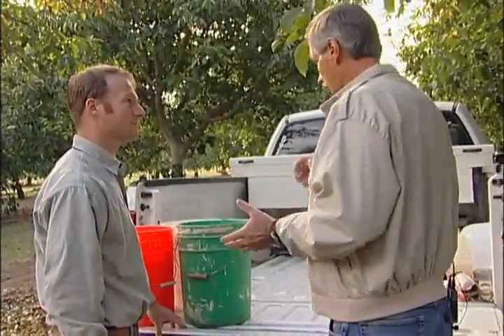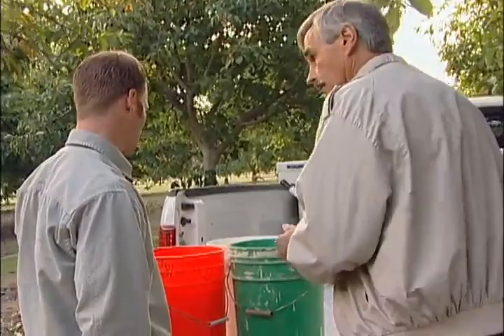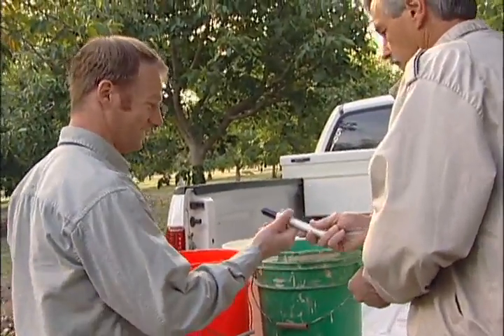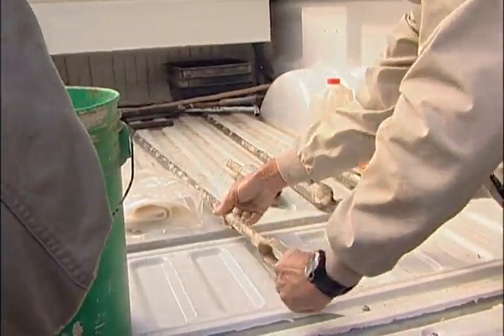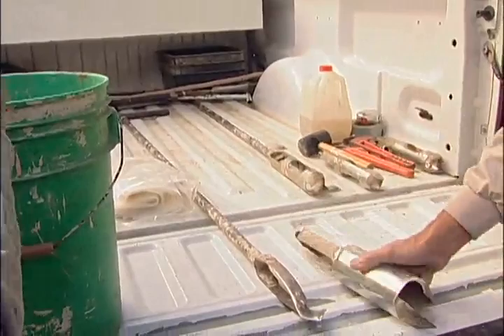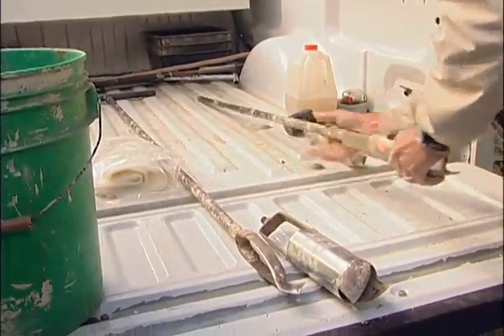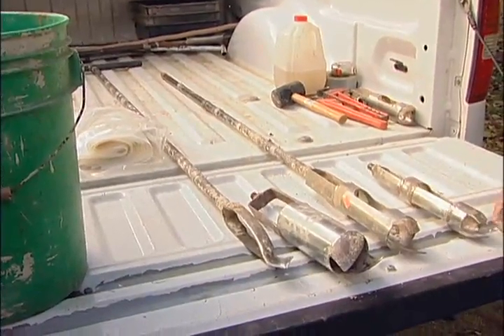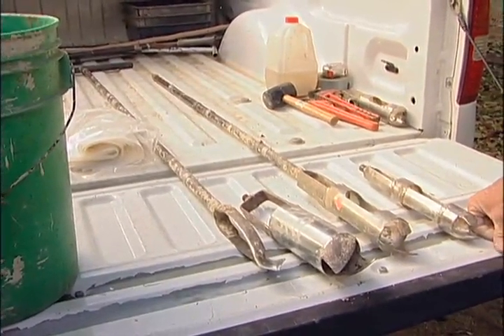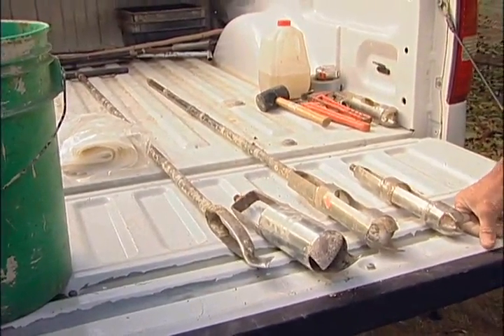The first thing we've got to do is label these buckets one, two, three. We'll be augering several holes in each zone but combining the soil from each depth into one bucket. That way we end up with one composite sample from several locations and will have a true average of the soil composition for that zone.